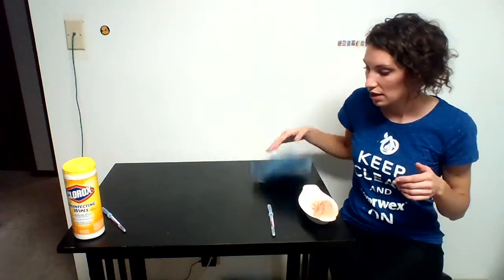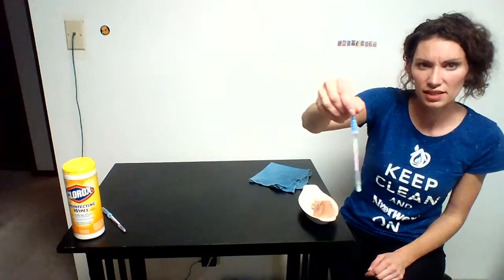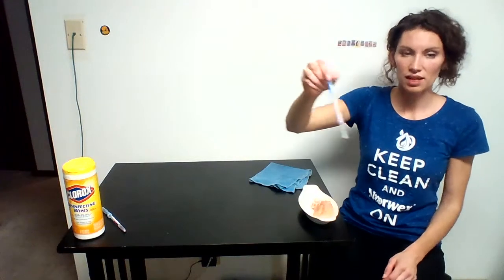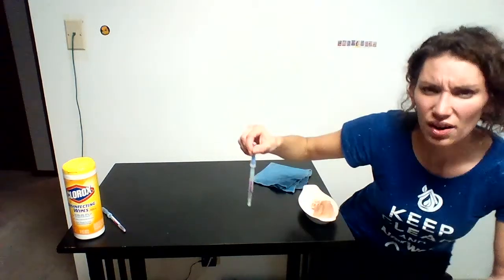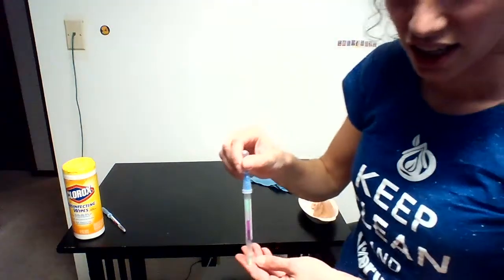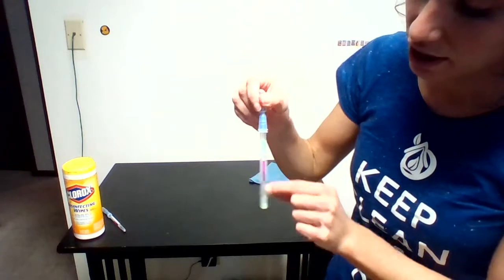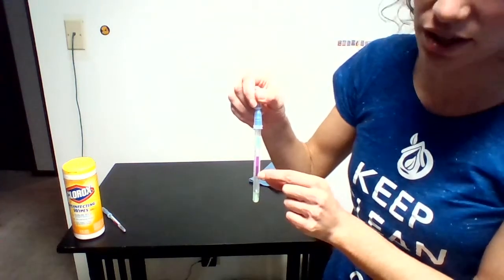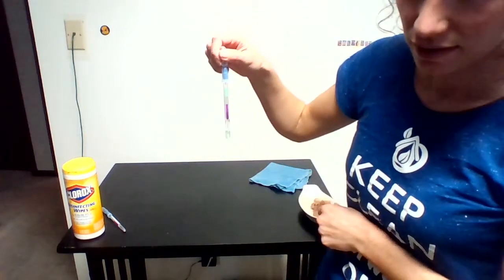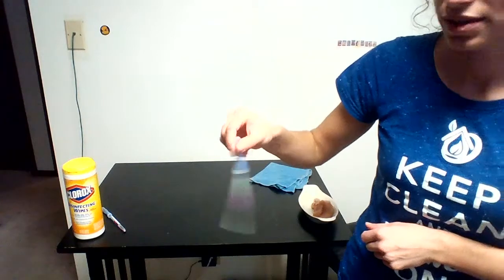We are going to look at the results. As you can see, this is green — hopefully you can see it, it's kind of hard with this lighting. On here there's actually green, clear, pink, and purple, and the darker or purple means that proteins have been found on the surface. This is green, so there was no protein found.